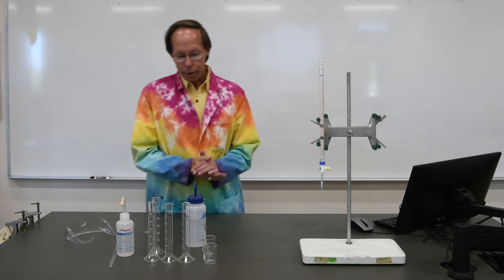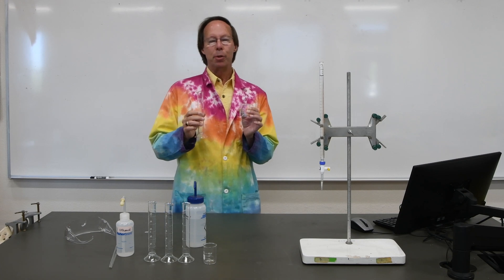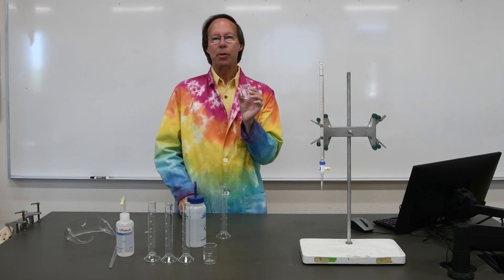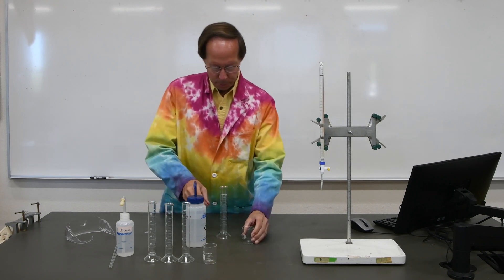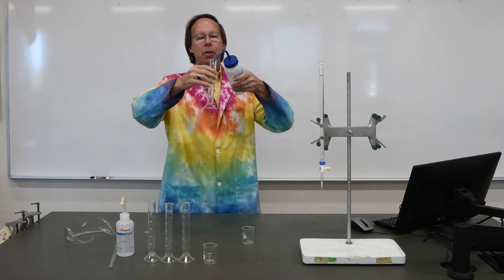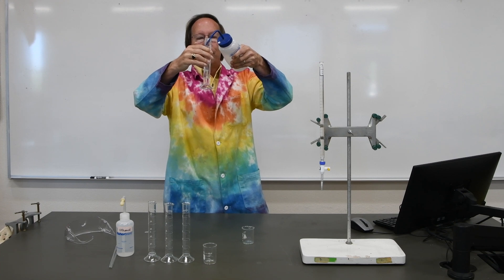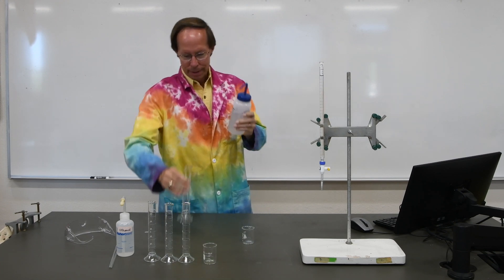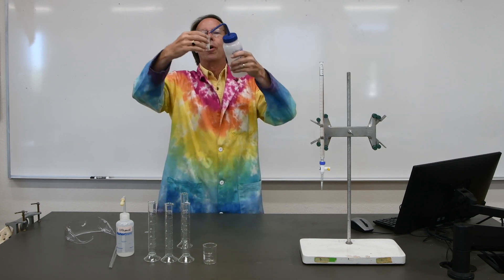Now let's compare the 50 milliliter graduated cylinder and the 50 milliliter beaker. Since the beaker is only graduated in 10 milliliter increments, we'd expect to get less accuracy. We'll go ahead and add again between 15 and 20 milliliters of deionized water to our graduated cylinder, and then we'll do the same thing with our beaker.